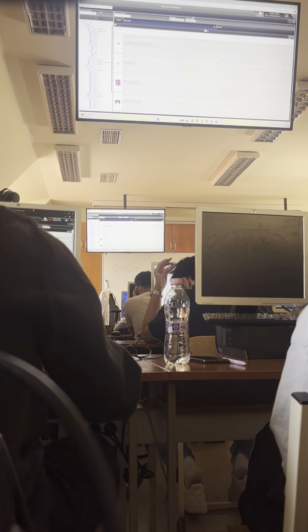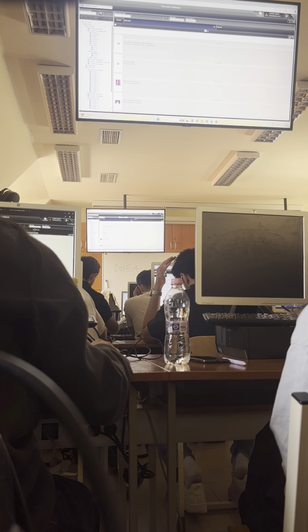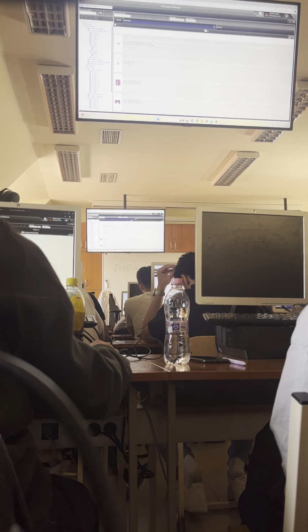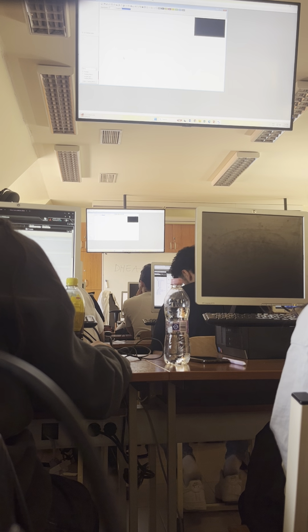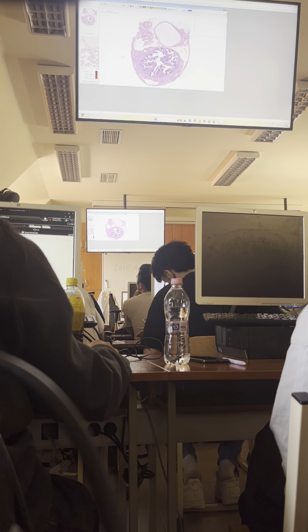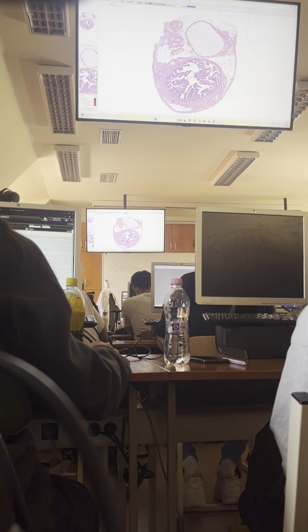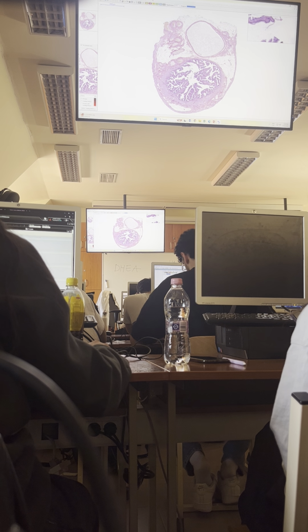And this is going to be a cross-section with hematoxylin and eosin staining. And the title says here uterine tube, but this organ has several other names. Could you name the other? Fallopian tube, oviduct, okay. In Latin, tuba uterina. That's something like uterine tube.